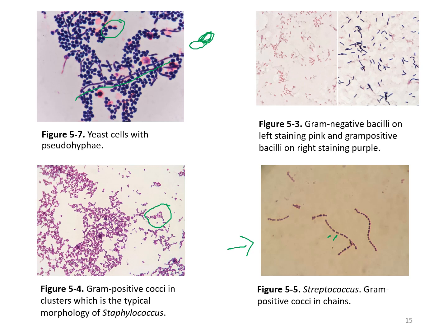On the left side you can see gram negative bacteria, and on the right side gram positive bacteria — bacilli in both pink and purple. You can see a little difference in size between them. In this particular image, it's kind of hard to see that these are rods because they're so small; this is where your microscopy skills in focusing come in to make sure you can see the outside edges of those cells to confirm they are in fact rods.